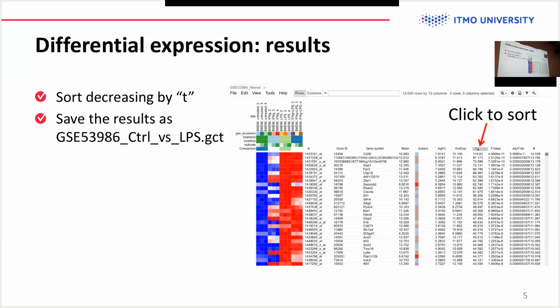and actually log 2 fold change. So it represents gene expression fold change in logarithmic scale. What that means is that this is log 2 scale, and actually it's important for limma that the normalization that we did before, log scale normalization, is actually important.